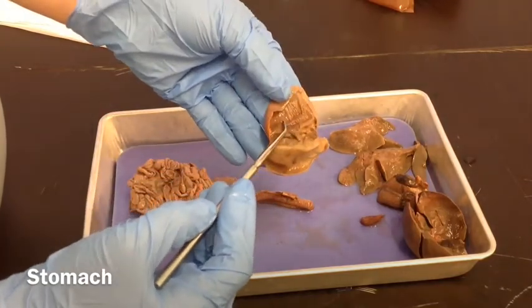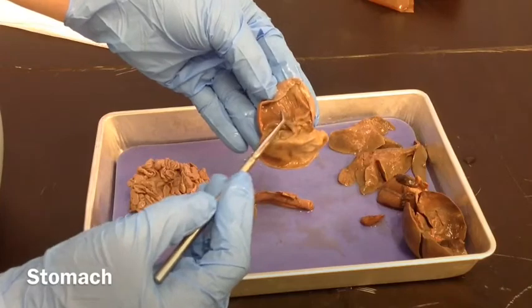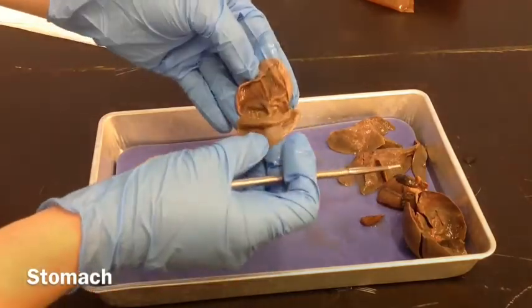You see these wrinkled spots — these are what's called the rugae. And that is the stomach.